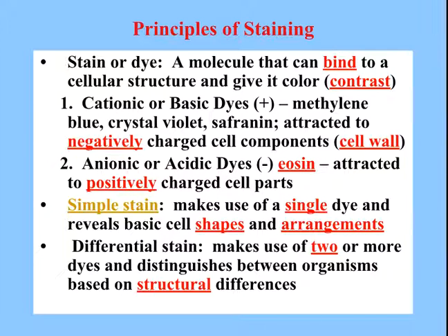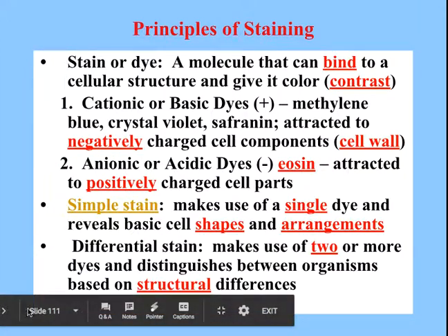A simple stain is what we did in our last class, where we used a single dye and it revealed the shape and arrangement of the bacteria. A differential stain makes use of two or more dyes and it will actually distinguish or separate the bacteria based on structure.